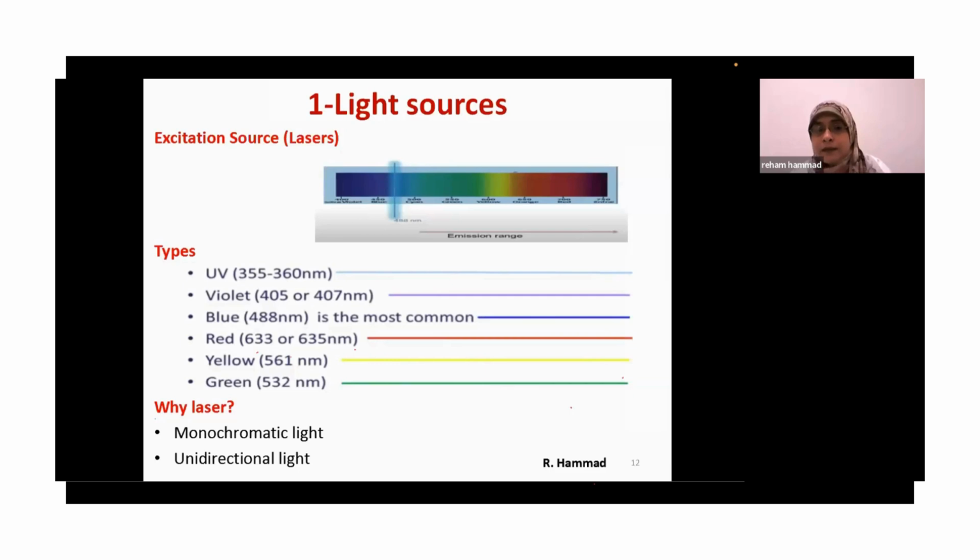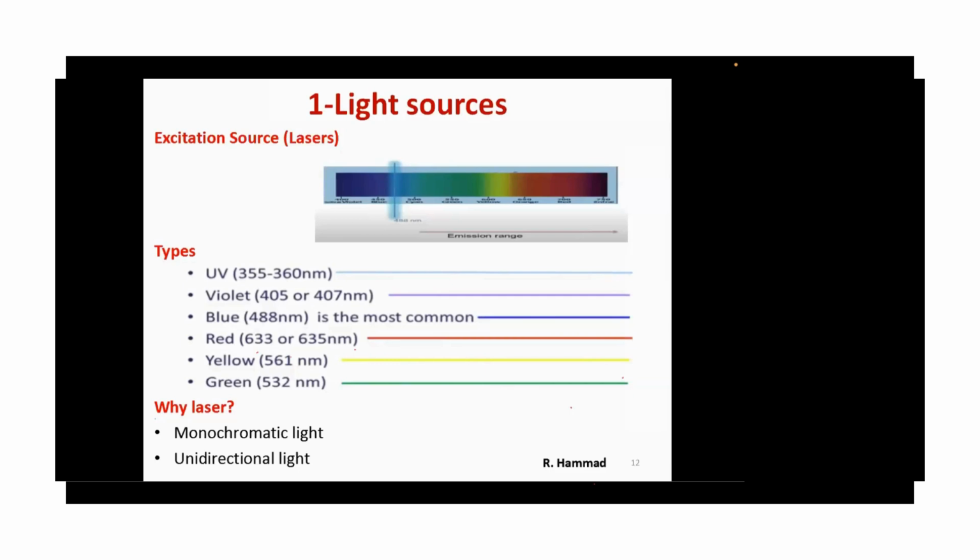What are the types of the laser that you are going to deal with?